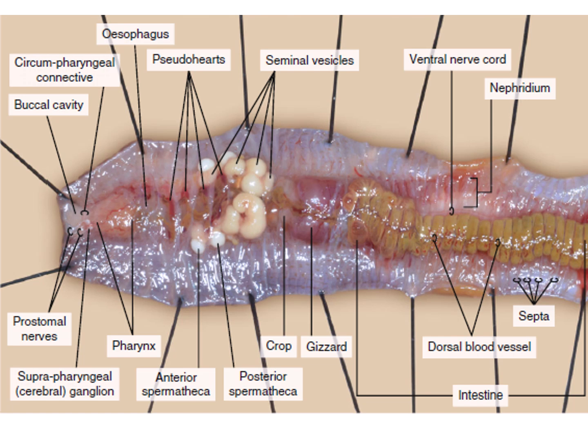We should have distilled water or isotonic saline solution poured on the whole individual, and the specimen should be submerged in water in order to avoid desiccation, because desiccated organs would not be easily visible. They would lose their structure and regress and not be visible. So we have to keep it submerged under water. We have to fill the tray with water.